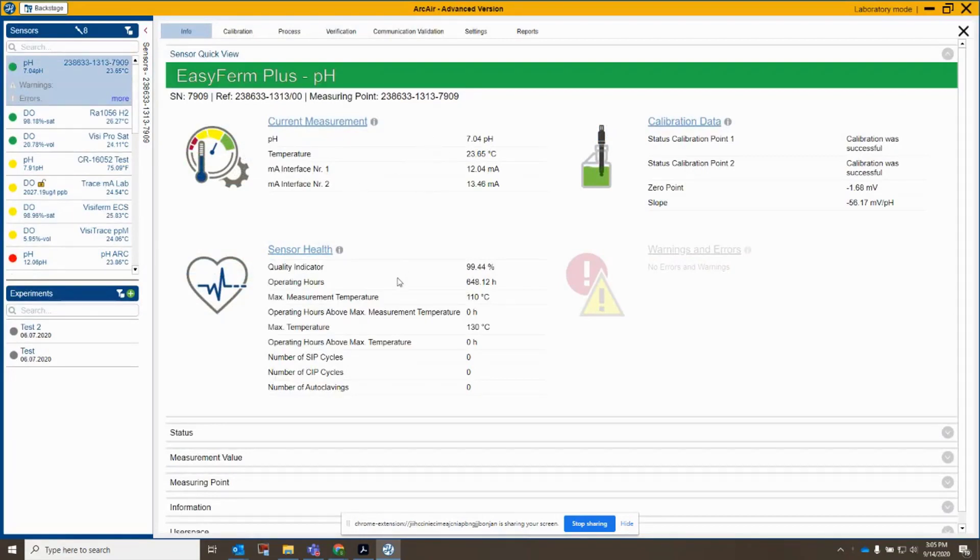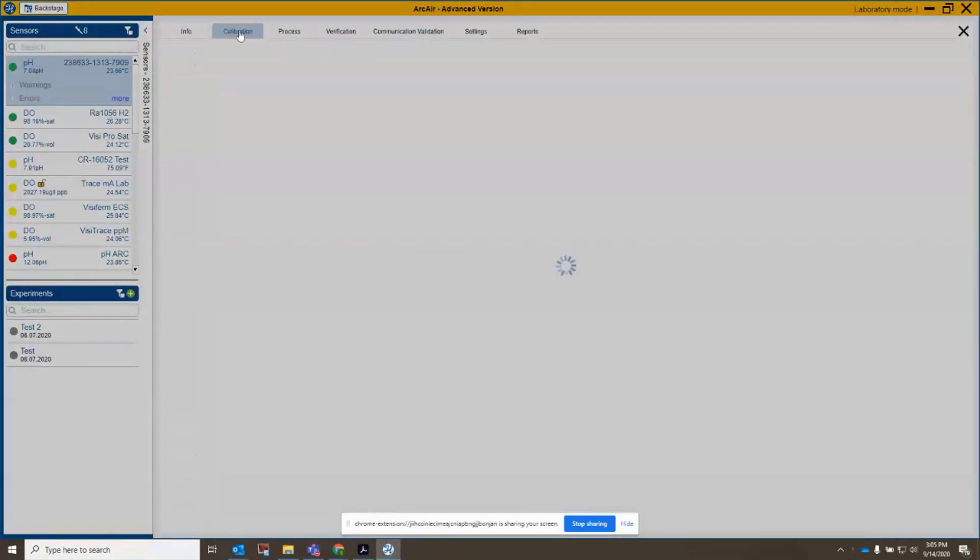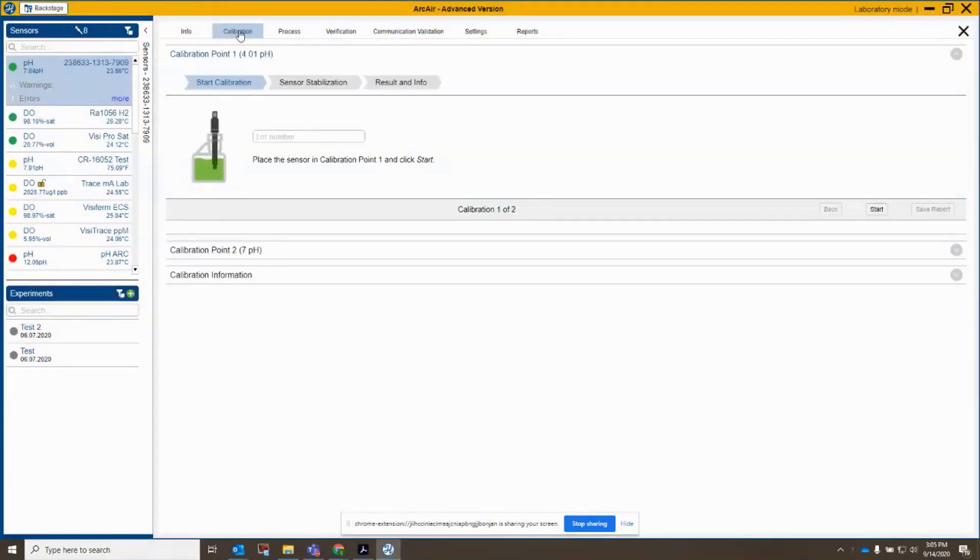So I can see my sensor here. It's got 648 operating hours on it. The quality indicator is quite good. So let's go over to calibration and see how this works.